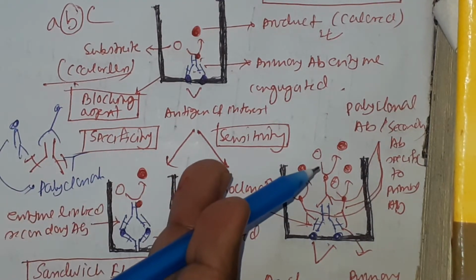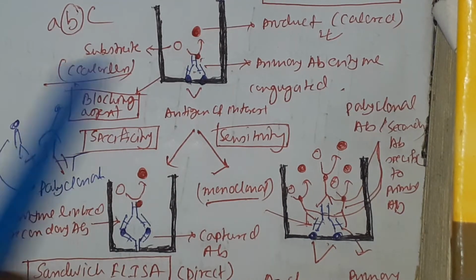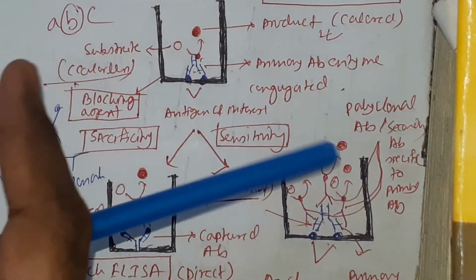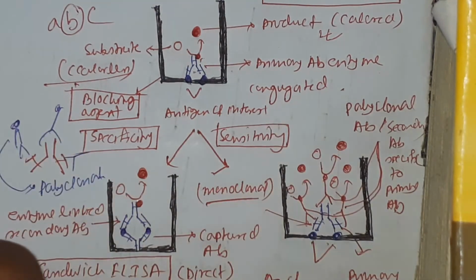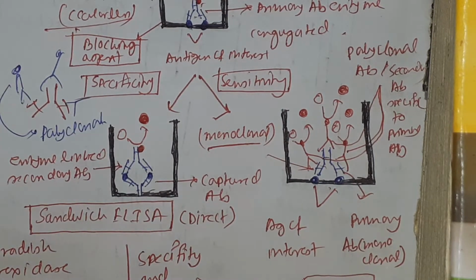So the secondary antibody will be added and then washing will be applied, and after that if we add substrate then it will convert it into a colored product. As there are multiple enzyme linked antibodies present, the intensity of the color will be higher. So the spectrophotometer finds it easy to detect the sample. Okay, so remember one thing, this is all about indirect ELISA.